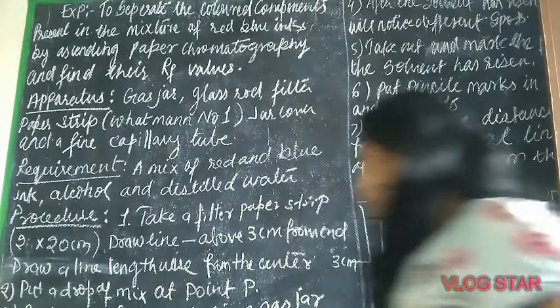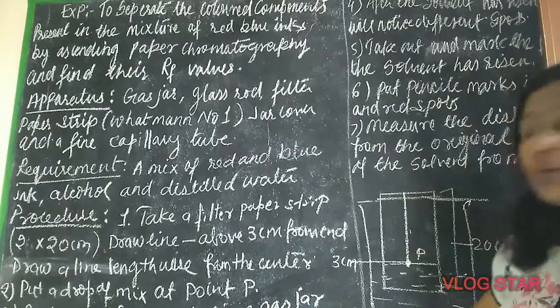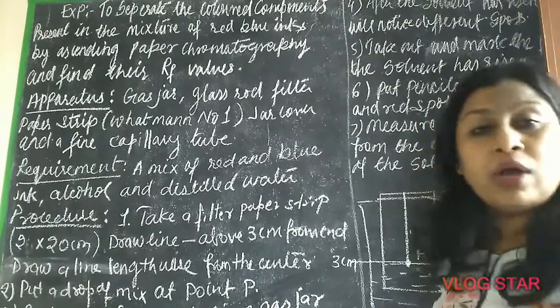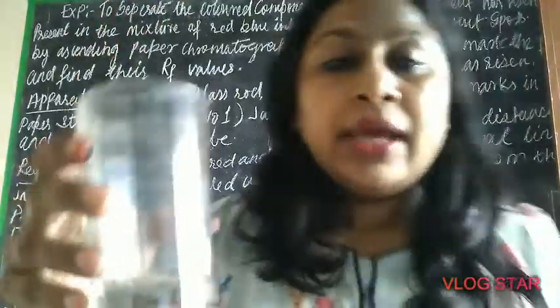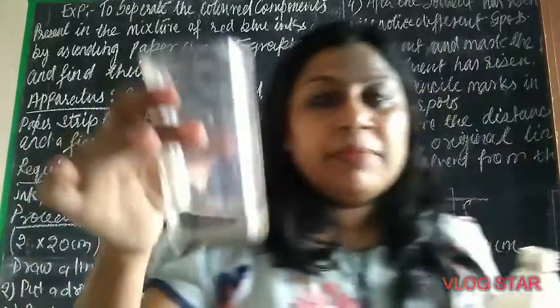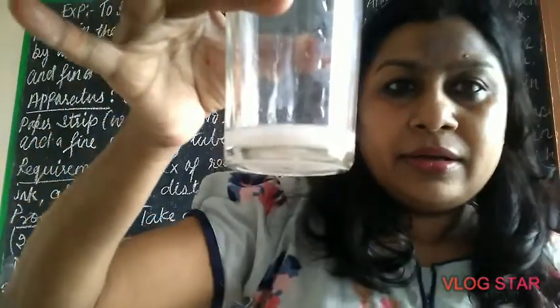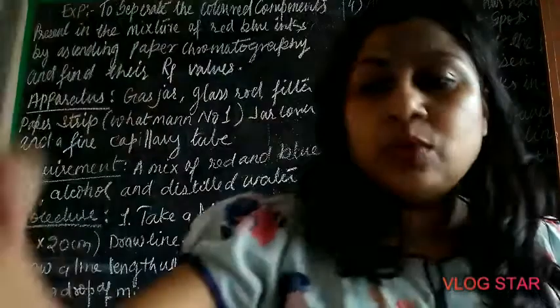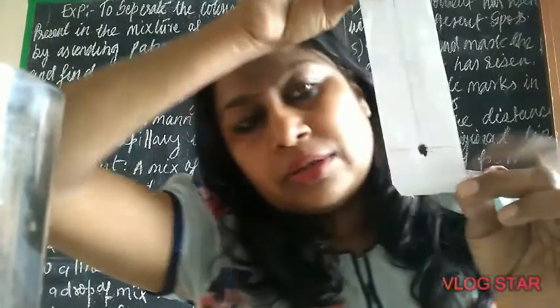Once the spot is dried, suspend the filter paper in a gas jar containing the eluent — the solvent. The solvent is 50% alcohol and distilled water. So in the gas jar, mix 50% water and 50% alcohol — this spirit alcohol. I've added the spirit here.